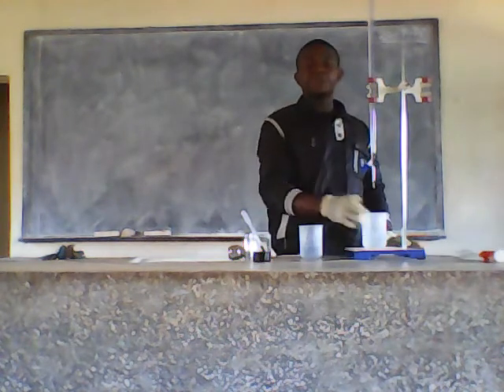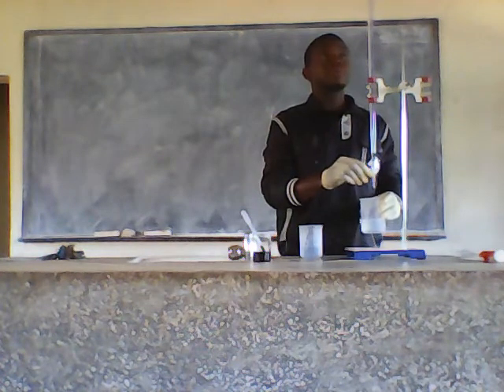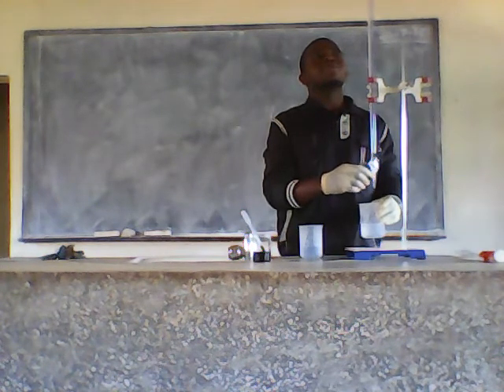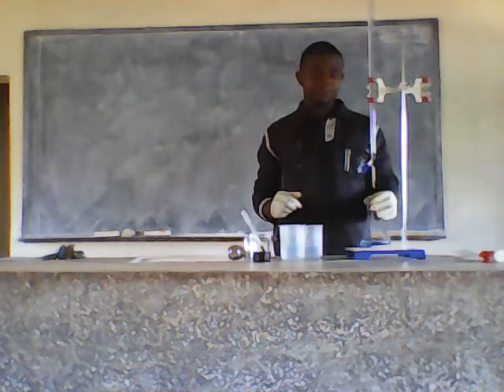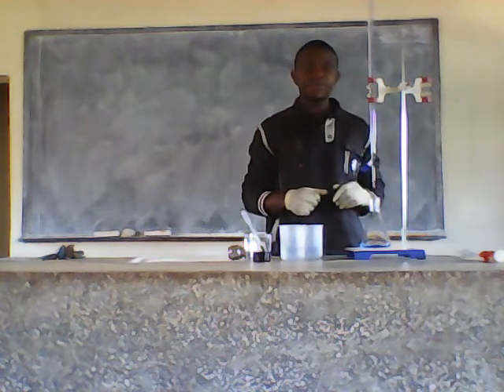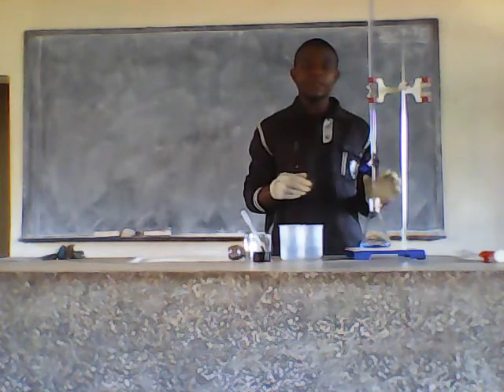Now I need to zero up my reading. Just open the tap — immediately it is at zero. So I have the zero mark here. Then the next step, I'll put my conical flask in. When you put your conical flask in, you use one hand to open the tap, then the other hand to shake the conical flask.